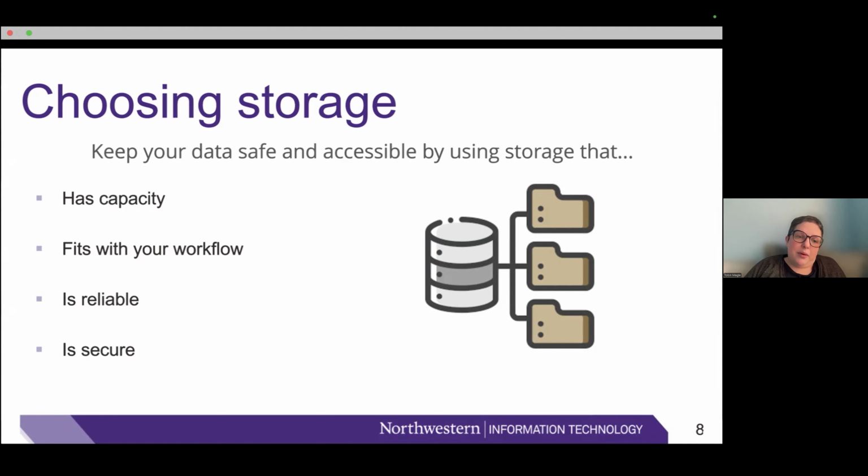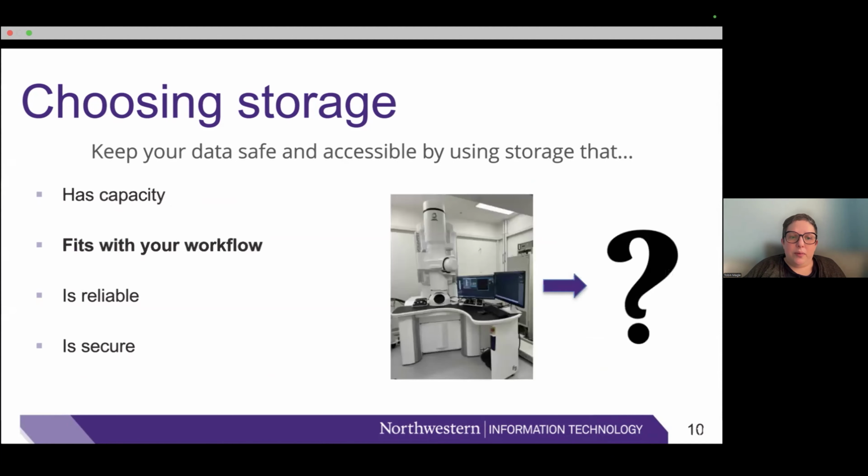You'll also need to think about whether or not it fits with your workflow. So I'm assuming that most of you are dealing with a lot of data that comes off of a scientific instrument. It probably lands on a computer that's next to the instrument, but where does it go from there? Where are you going to analyze it? Where are you going to store a stable copy of it? Things like that. And also, where is it going to go at the end of your project?